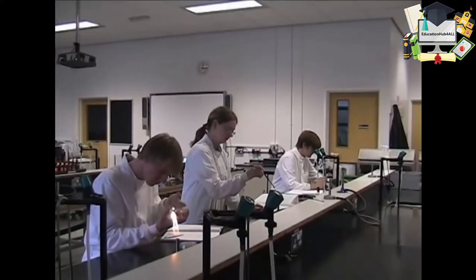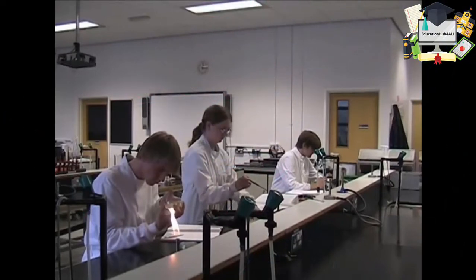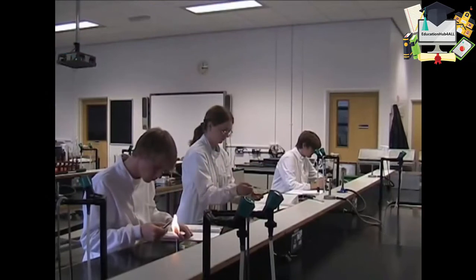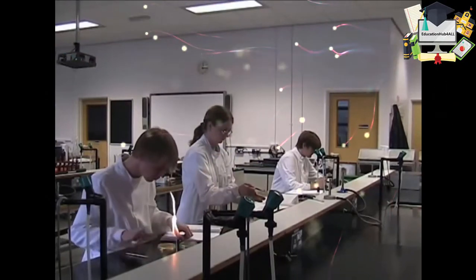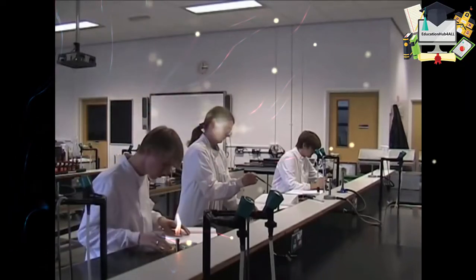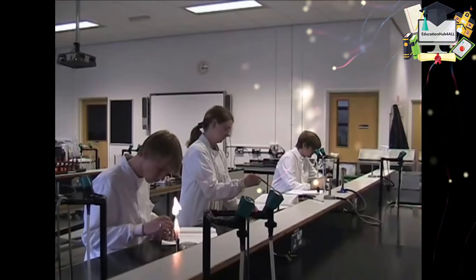It's very important that you have a well-organised bench space. You'll be working with both liquid cultures of bacteria and solid cultures. Liquid cultures should be in a test tube rack. Your solid cultures will be in the plates. Organise yourself so that you never have to stretch over a Bunsen to reach anything.